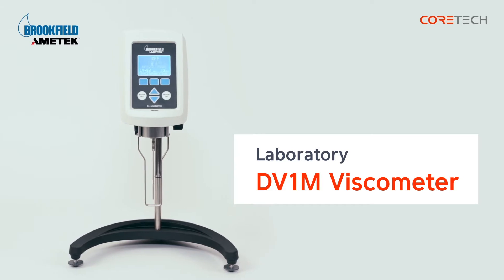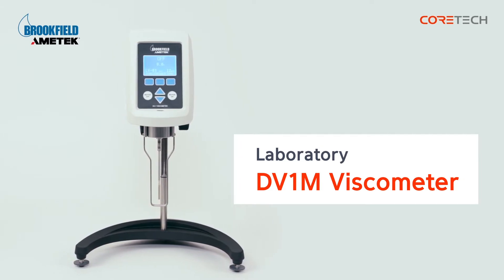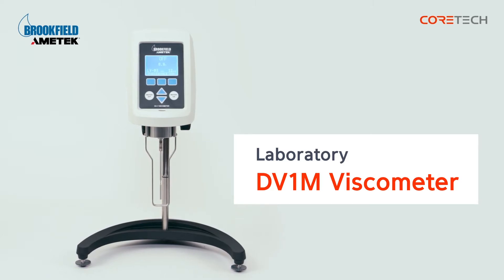The DV1M viscometer is an accurate, reliable viscometer. 18 speed choices are available for viscosity measurement. It also shows you the information that you need with LCD display output. In addition, you can measure the temperature by purchasing the optional RTD temperature probe separately.